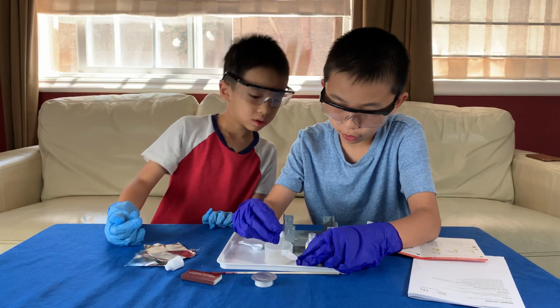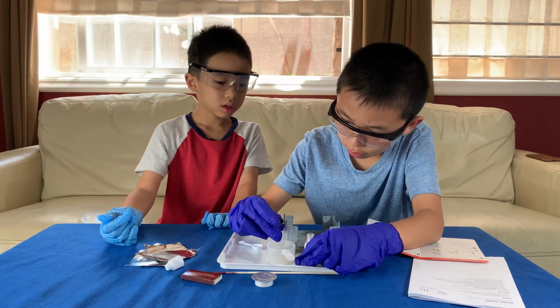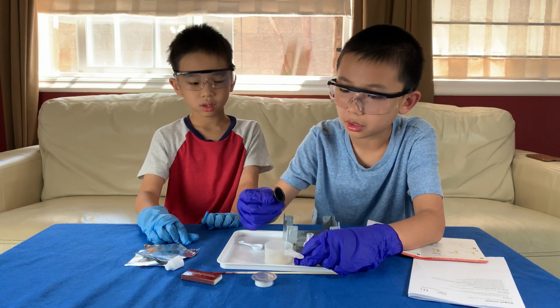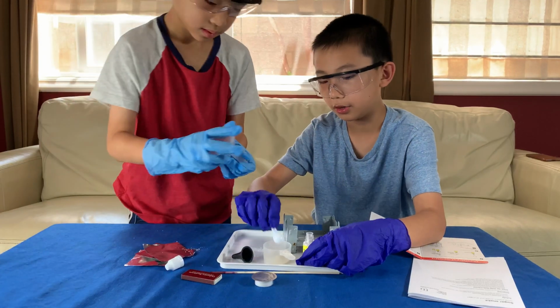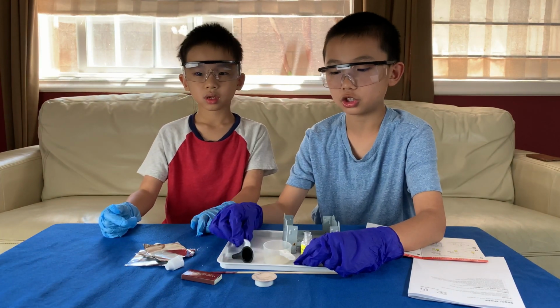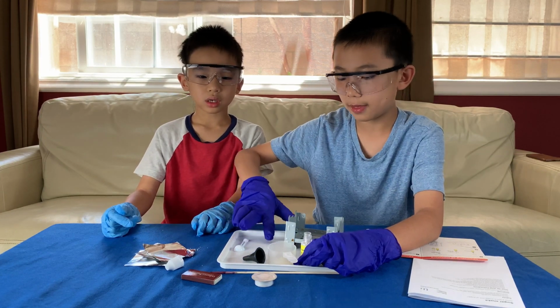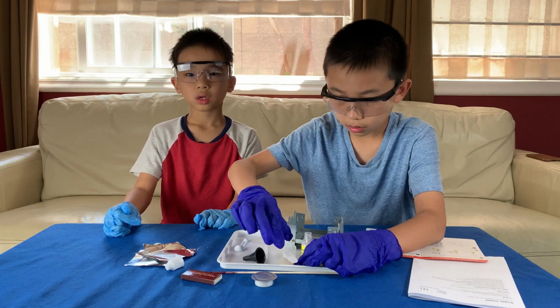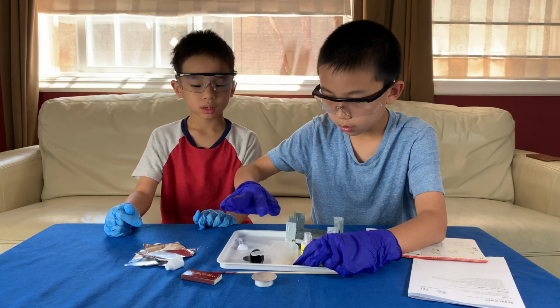Okay, first I'm going to try pouring it into it. Okay, I'm just going to pour it back because obviously this is not working. See, there is a hole. It's just not working. I see if it even fits. Yep, it doesn't fit. See, it's the small one. But that one, the sugar can go through. Oh, I see. But if that were the case, do we have another funnel? No, it's only two. Did the sugar clump together? Was it wet? Yeah, maybe that's why. Maybe the funnel was wet from before? Pause.